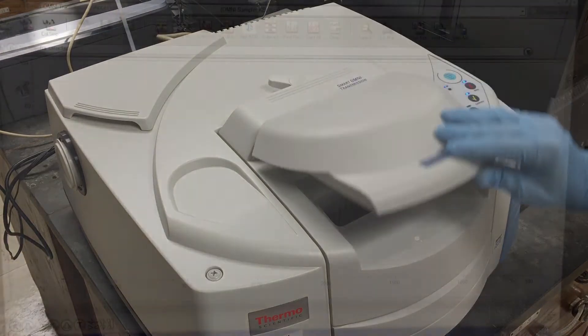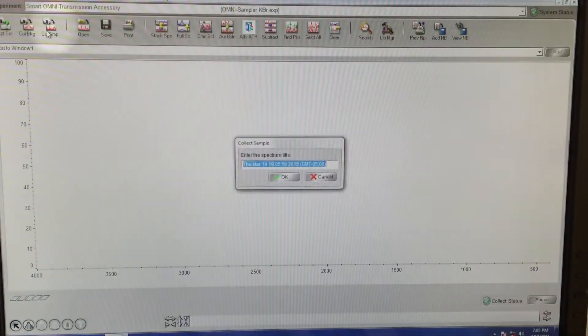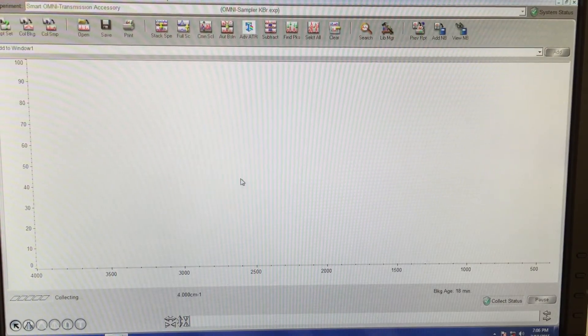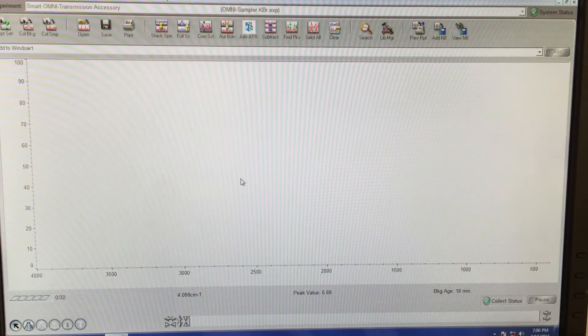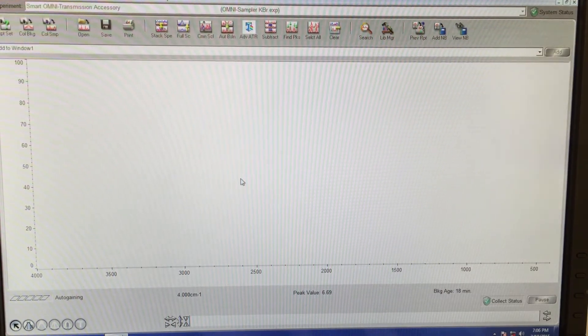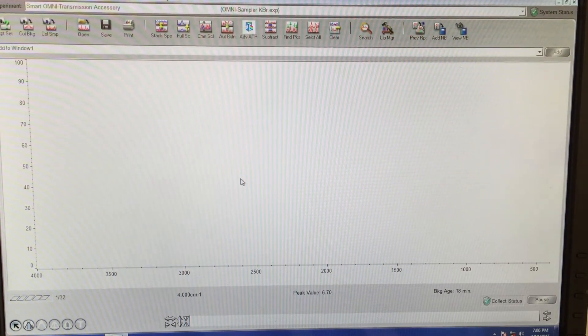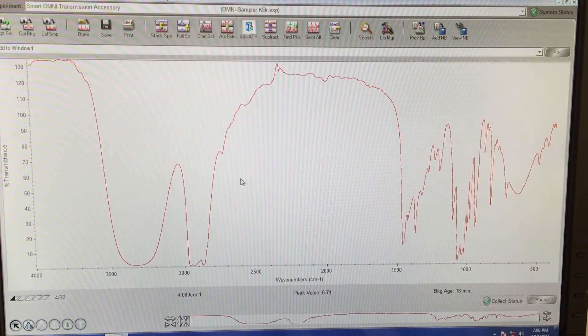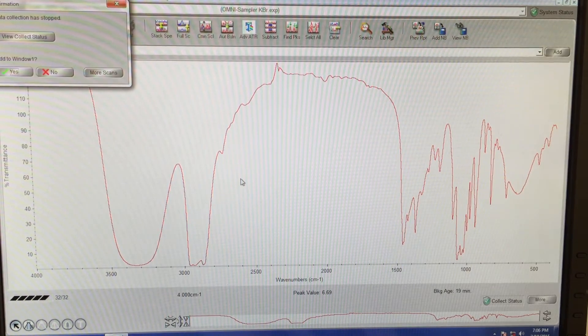In OMNIC, click Collect Sample. When the scan is complete, a dialog box will appear. This time, click Yes to keep the spectrum in the window.